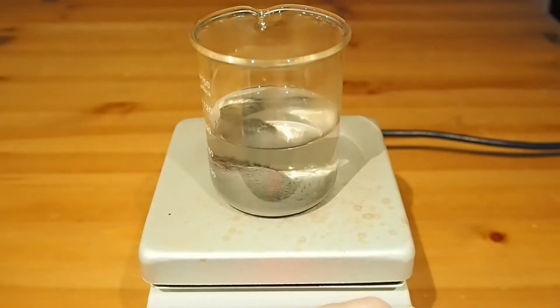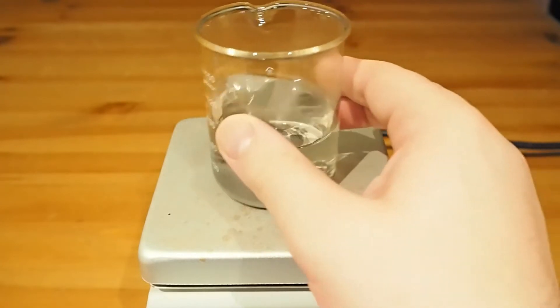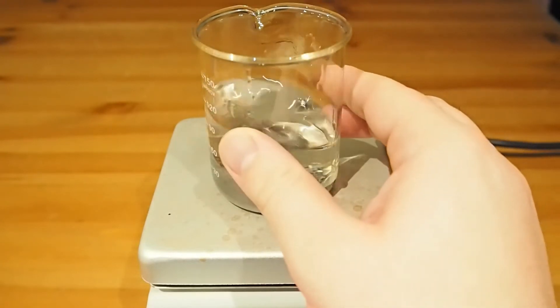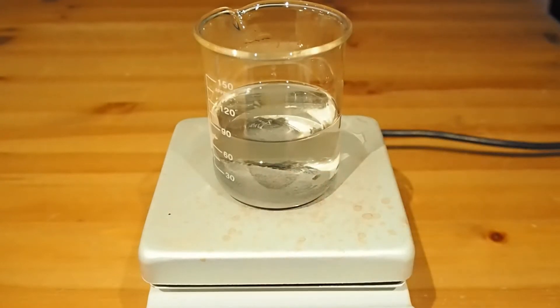In fact, if I put the stirrer on — oh, don't splash the water around all over the place. That's no good. I'll go chuck a stirrer bar in there.